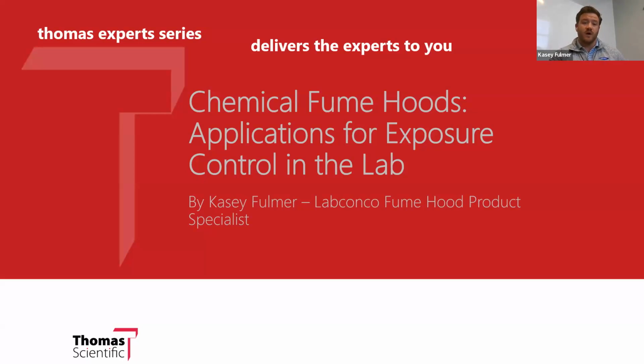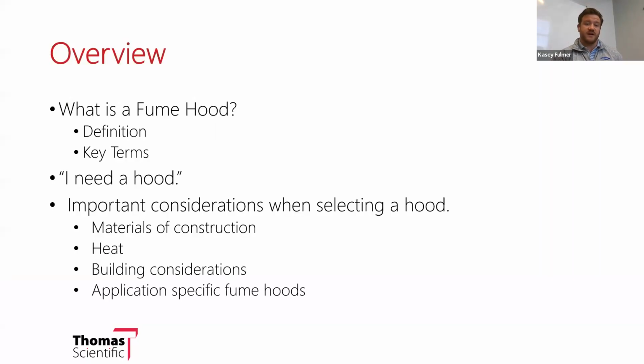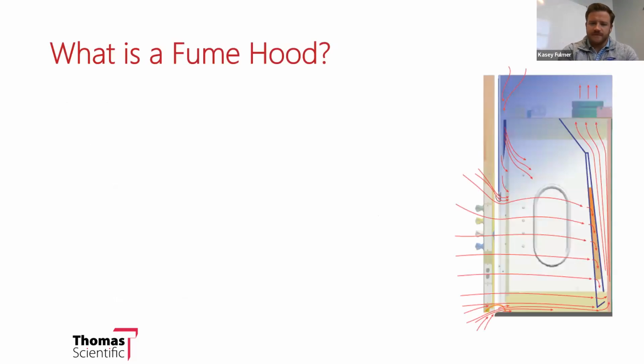We're going to talk about what a fume hood is, just defining that. Talk about whenever you hear the ever specific "I need a hood" comment, and then we'll discuss all the different things to consider whenever selecting a hood, making sure the right one is placed in your lab or your customer's lab.